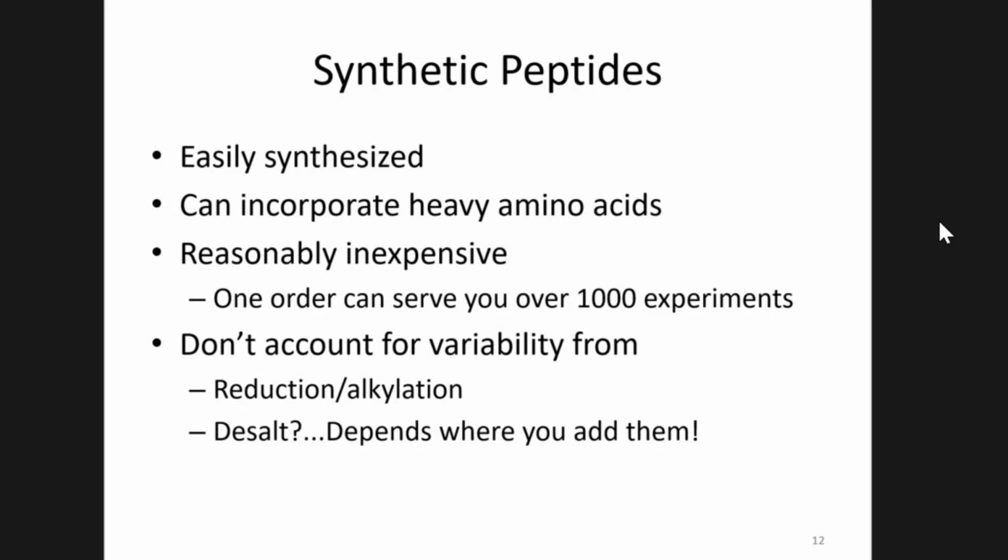But you wouldn't account for the variability due to the digestion. So it kind of just depends. You can spike it in anywhere, but you have to be very upfront with what variability you're addressing and what you're ignoring because you're not accounting for it.